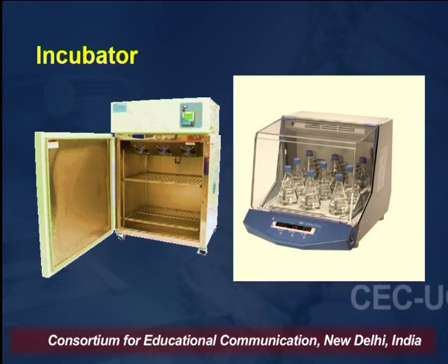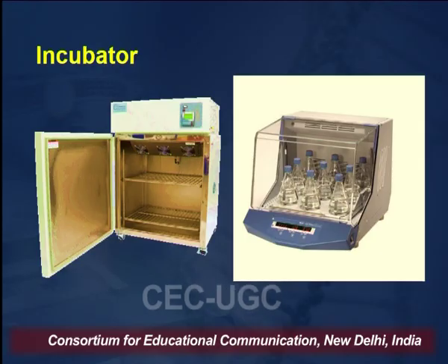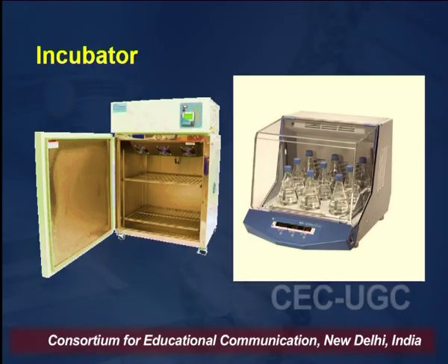On the right hand side, there is an incubator with an agitator. You can see the flask. So, it can shake the flask for the continuous mixing of the culture.